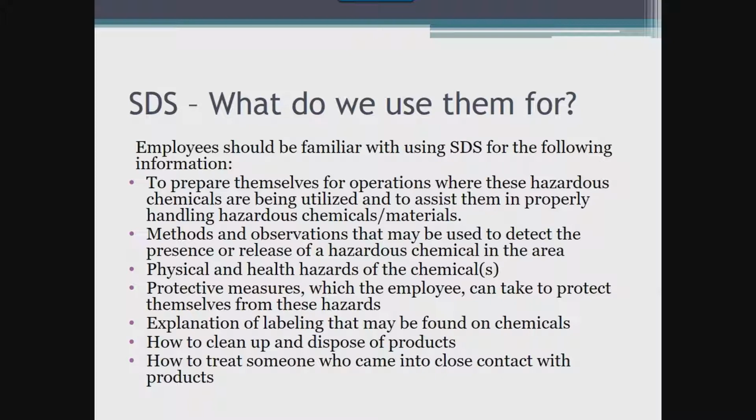To start, this information can be used by all staff as education on the chemicals that they are being exposed to and how to safely and effectively use them without creating any more risk to themselves than necessary by the nature of their job. Education on these chemicals and their properties could help avoid situations where employees are exposed unnecessarily by understanding what to look for in the event of an incidental situation.